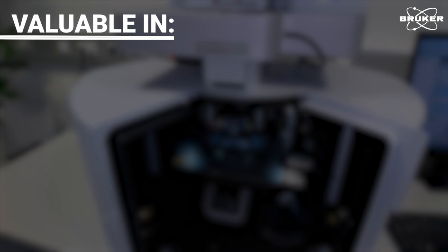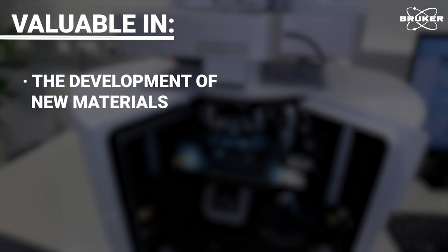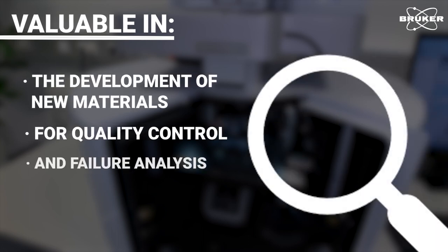Such analyses are valuable in the development of new materials, but also for quality control and failure analysis.